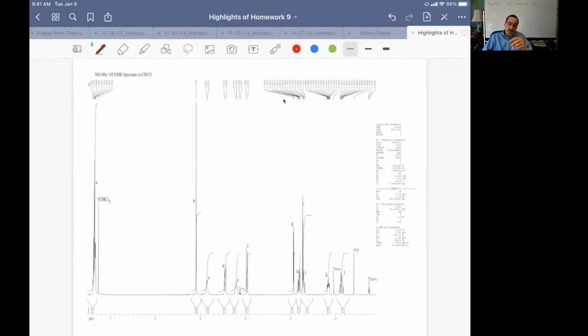And I didn't think he'd be able to nail all of the diastereospecific assignments of diastereotopic methylene protons and figure out the stereochemistry of the molecule. But every stereocenter in the molecule you can figure out relative to each other. Every diastereotopic methylene you can figure out relative to each other. The NOEs really beautifully show the conformation of the ring in this molecule, as do the J values and coupling patterns.